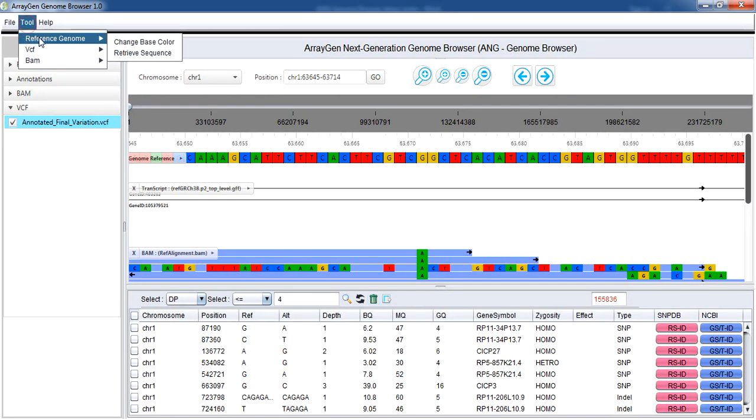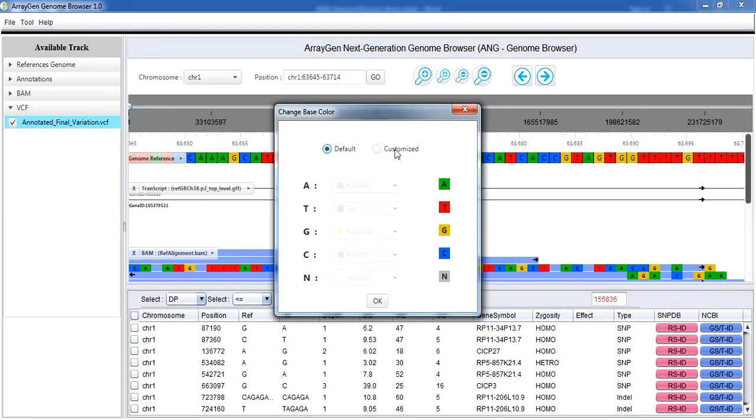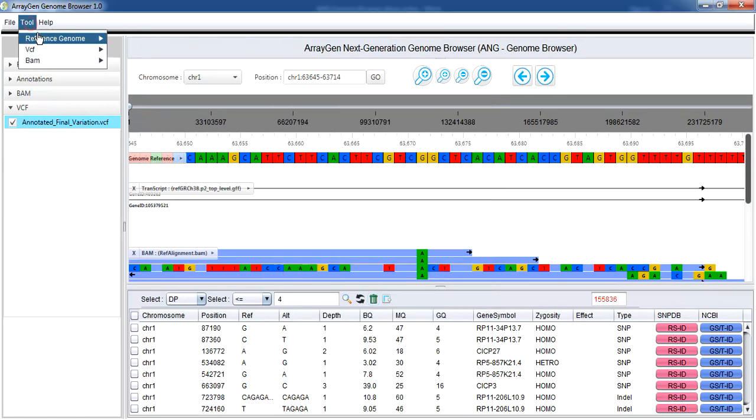Additional features are available in the tools option in the toolbar. Reference genome's base color can be changed using this option. It is set to default.